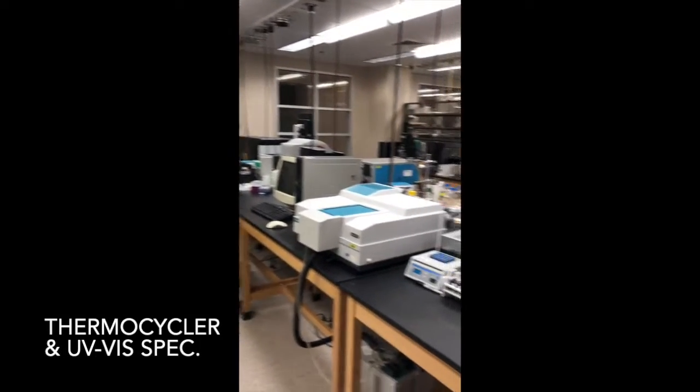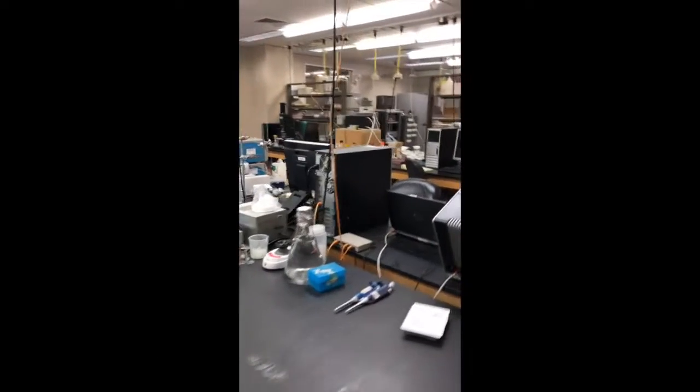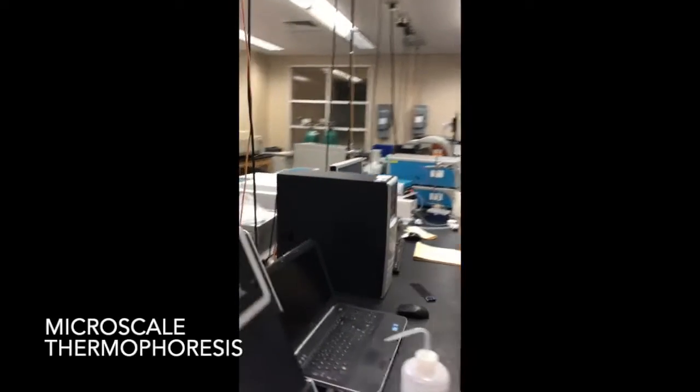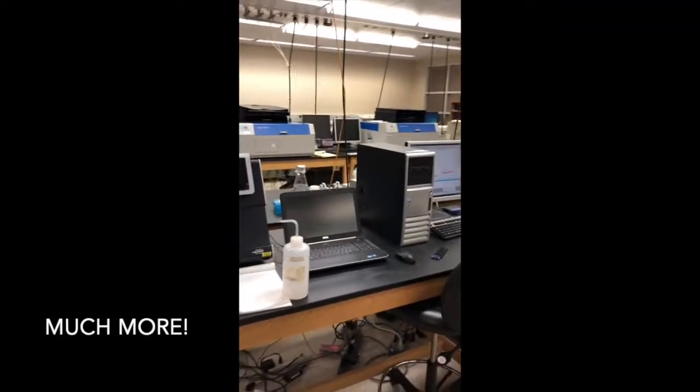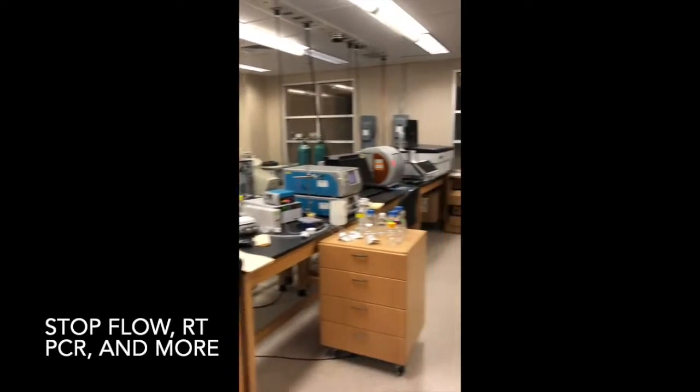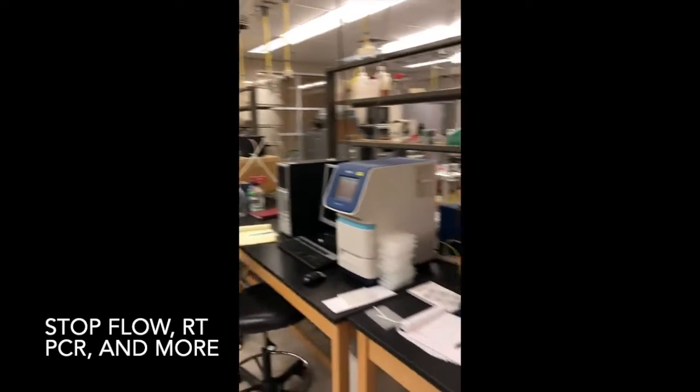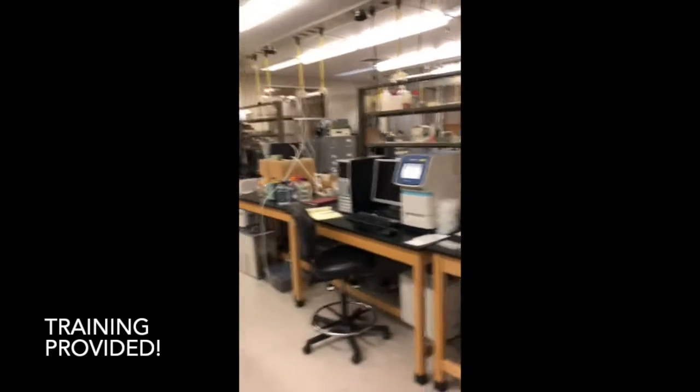On the opposite side we have thermal cyclers. There's a UV vis that we use regularly. Instrument here for microscale thermophoresis. Nice for doing binding measurements. A few other instruments including a stop flow on the other side and an RT-PCR instrument there.